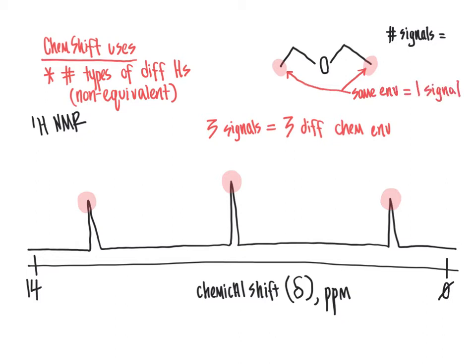There are a total of 6 protons that would comprise that one signal, because you have a CH3 group here and a CH3 group here. Since those are totally symmetrical in the molecule, they are both directly connected to a CH2 group, and that CH2 group in both cases is directly connected to an oxygen and so on. Those are going to be exactly the same chemical environment, meaning they're bonded to the same number and type of atoms, resulting in them being seen as one signal.